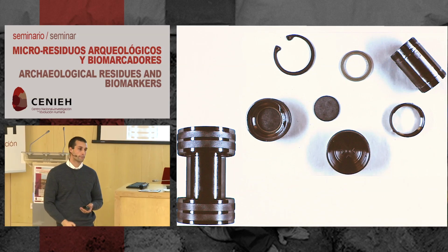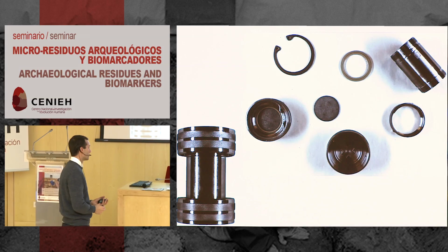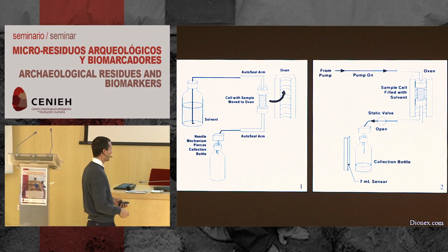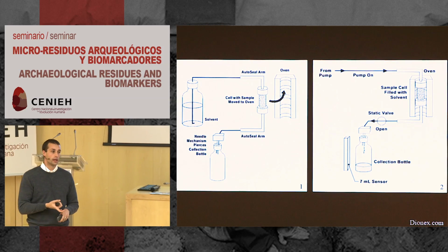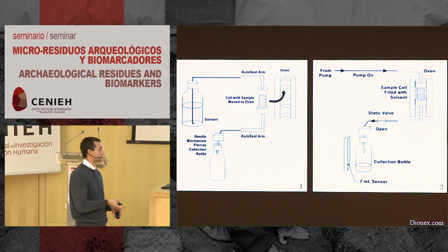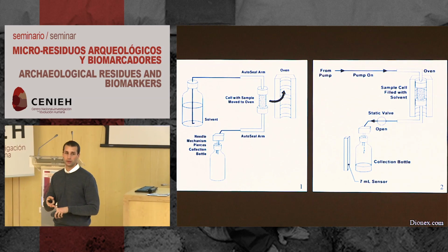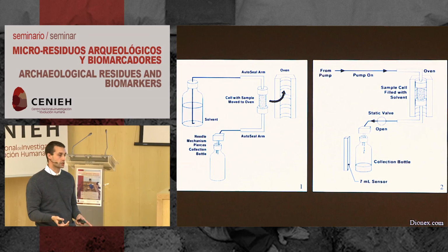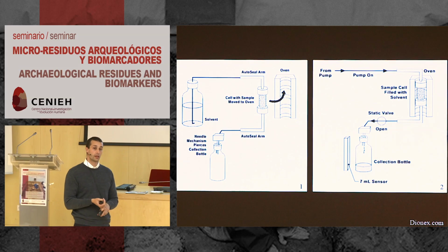Is it easy for you to summarize what solvents are using for each analysis? Yeah, of course. I have a few slides. I use dichloromethane and methanol to extract the N-alkanes, and it's all based on polarity. So if you know you have a really polar compound, you might need to use something a little different. Methanol is actually quite a polar compound.